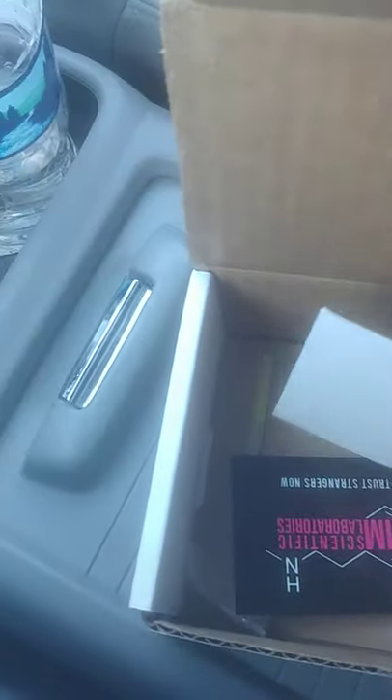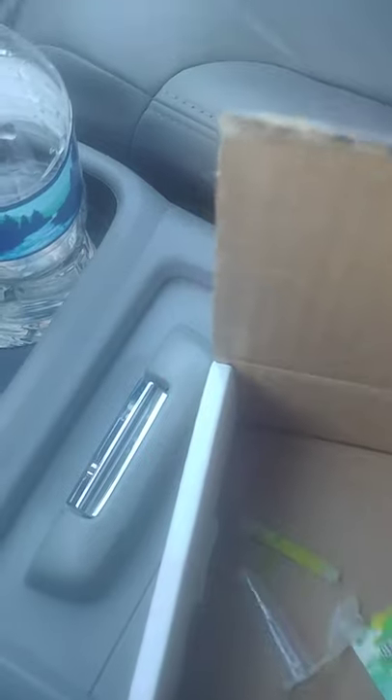These three testers test like everything. I bought it mainly for Molly because I used to love rolling. It seems like nowadays the Mollies and the E-Pills are bullshit — people trying to sell you bath salts. I guess you also get a little laser just in case you get some good shit and get all happy and want to play with your laser.